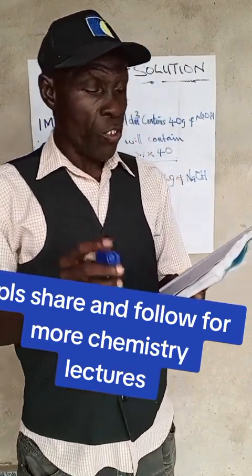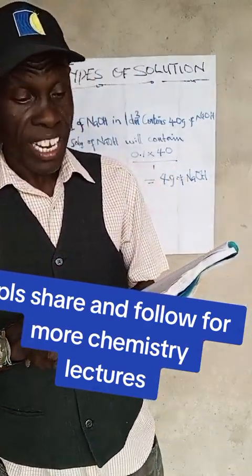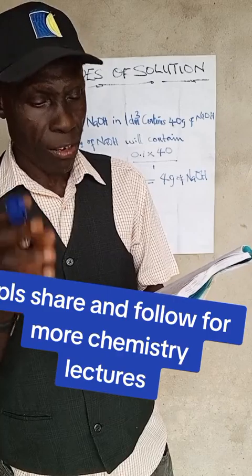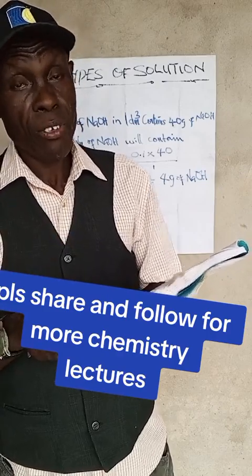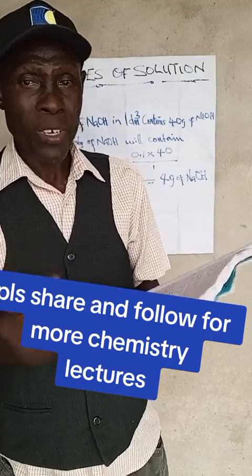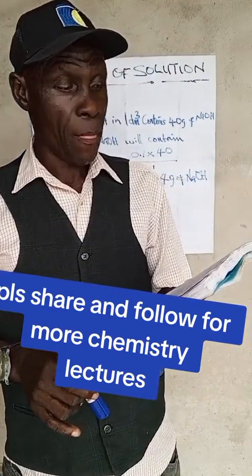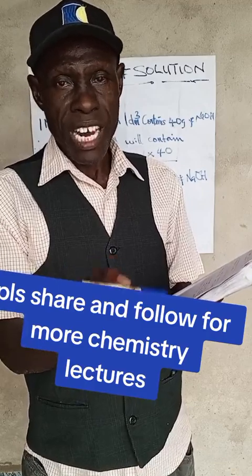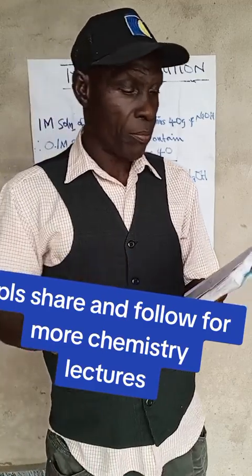Four, you must also be very fast and accurate in measuring or weighing that particular chemical substance. Why? Because some chemicals, such as sodium hydroxide and others, are hygroscopic. In other words, they absorb water vapor from the atmosphere and increase in weight. And therefore, you might be measuring a little amount of it, but the grams and the weight become more because of the water it absorbed.